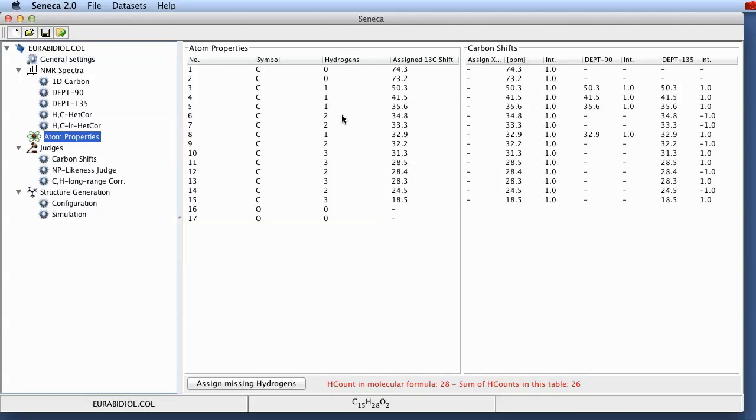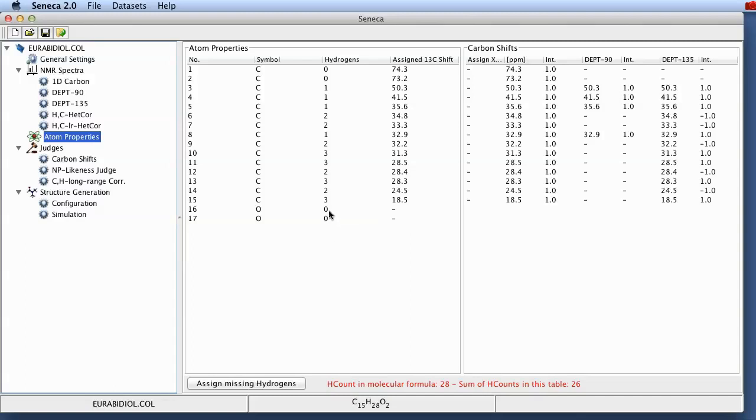It then does a little bit of accounting. Here at the bottom you can see that the hydrogen count in the molecular formula is 28. But the sum of the assigned hydrogens at the moment in this table based on the DEPT information is just 26. So there are two surplus hydrogens which clearly must be attached to those two oxygens.